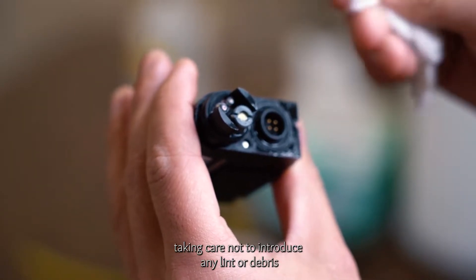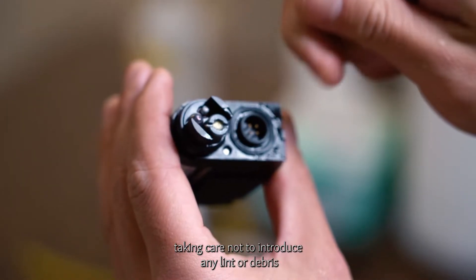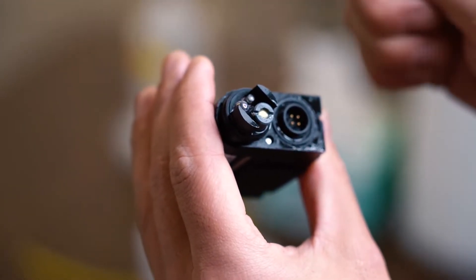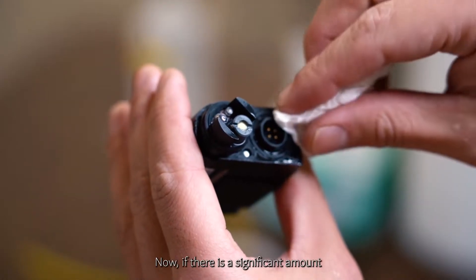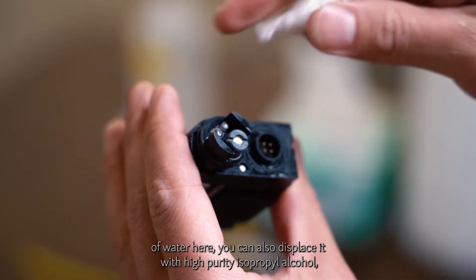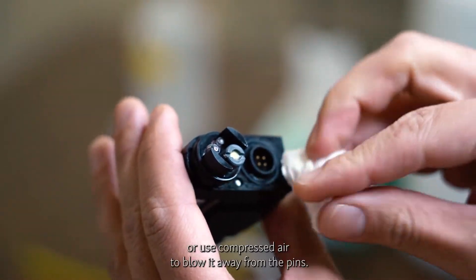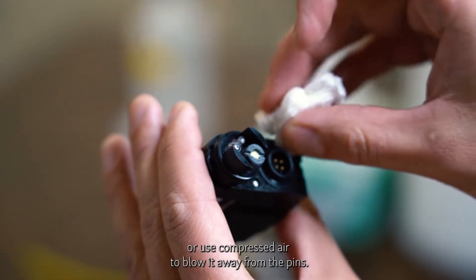Take care not to introduce any lint or debris to the O-ring sealing surface. If there is a significant amount of water, you can also displace it with high-purity isopropyl alcohol or use compressed air to blow it away from the pins.